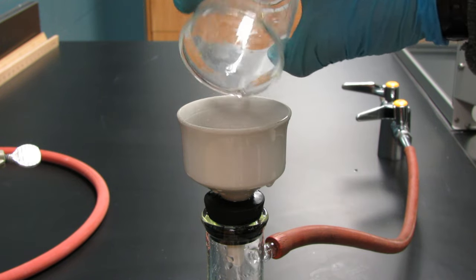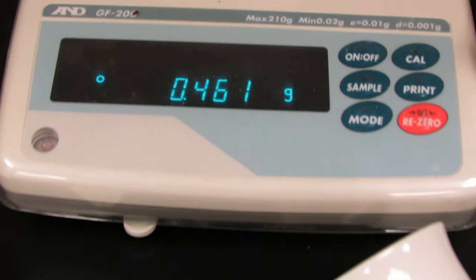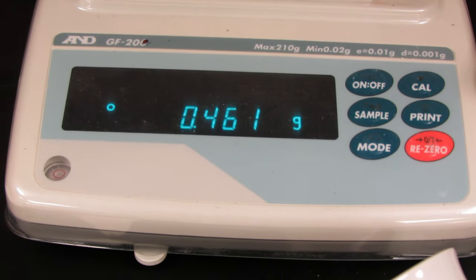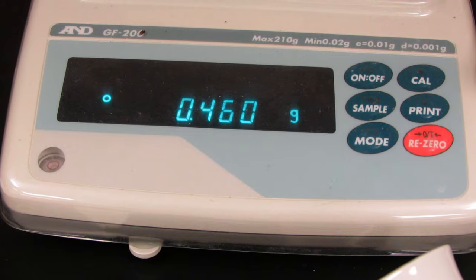We can perform a vacuum filtration. There's the copper we started out with. I weighed this and it was 0.461 grams, but I lost about 0.04 grams during this experiment.